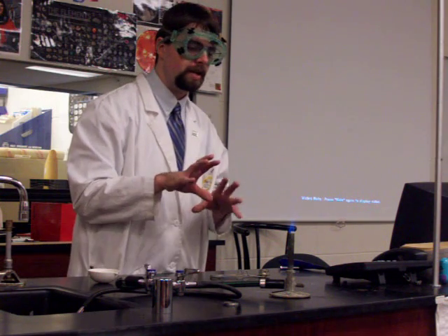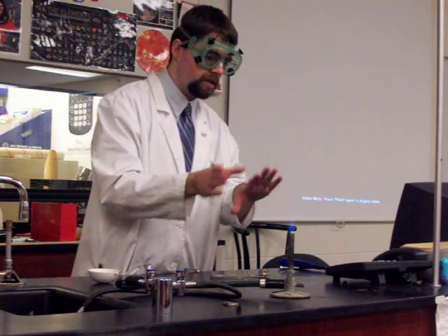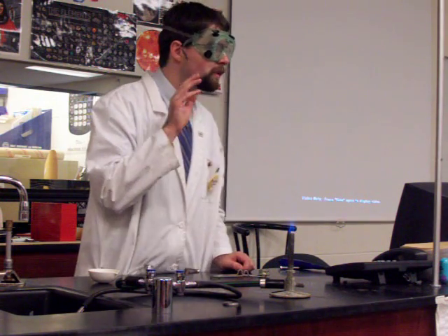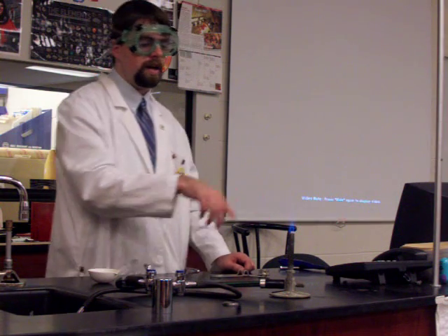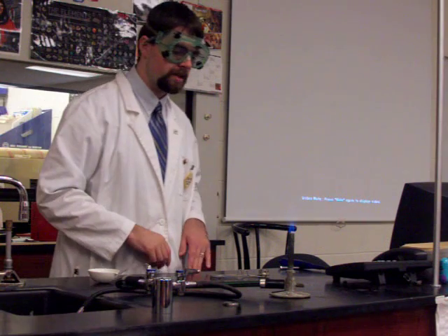Your first lab will actually look at what color of flame is best, where is the flame hottest, and how to adjust the burner itself. You'll also notice that there is a slight ripple here or flickering noise. That's from the inner flame there that you can see. It's best to have that as quiet as possible. It's usually very hard, though, to get it totally silent.